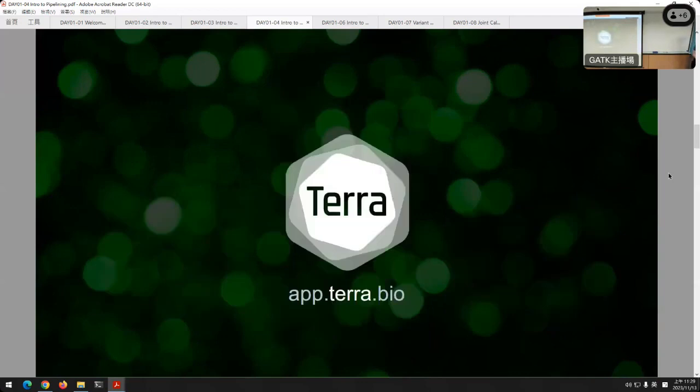You've all signed up for Terra and made an account, and we mentioned that that's what we'll be using for a lot of our demonstrations, because then we can all be using the exact same environment. You might have a different version of Python installed on your laptop. That doesn't matter because we can control the environment, etc.